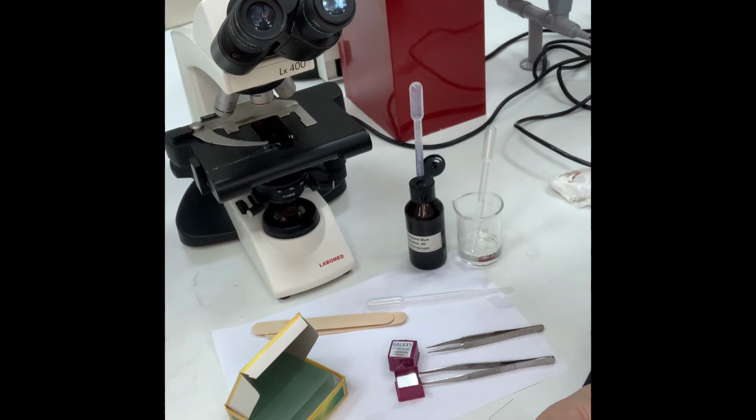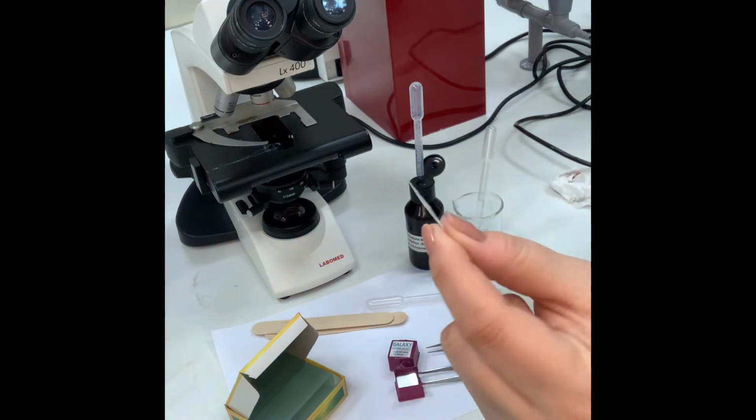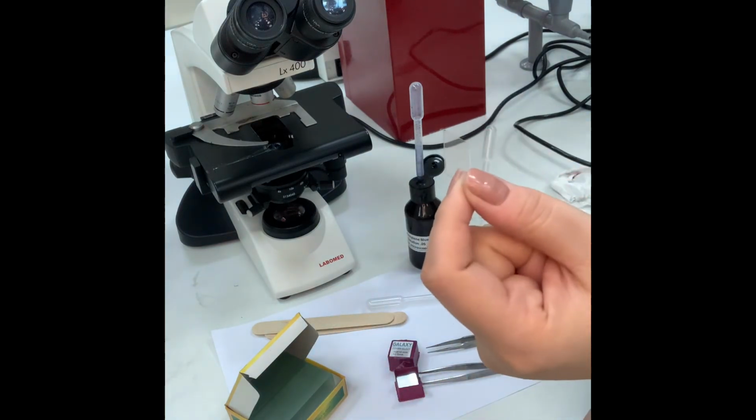Now, for the materials that we need for wet mount slide preparation, I need you to memorize them because they're common in wet mount slide preparation. I need a microscopic slide, a cover slip, and from the name cover, it covers the sample.